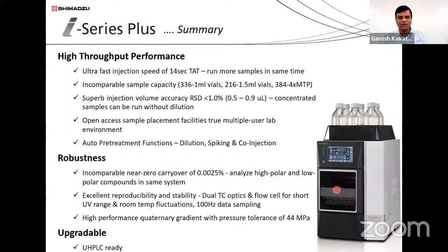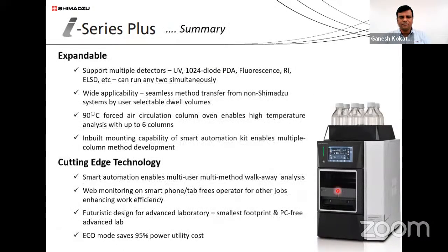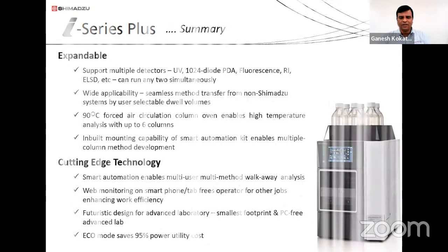Then high polar or low polar compounds you can use on the same system. You may use hexane, you may use water, you may use any other detector. Just while transferring from one phase to another, we need a thorough cleaning. That's it. So that is some of the cutting edge technology we have.